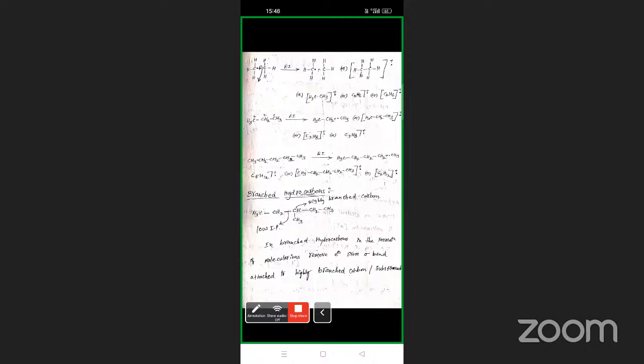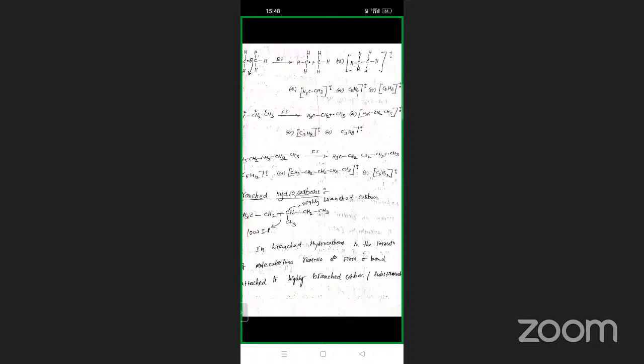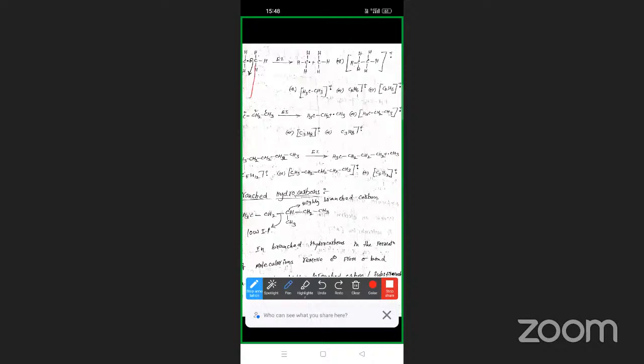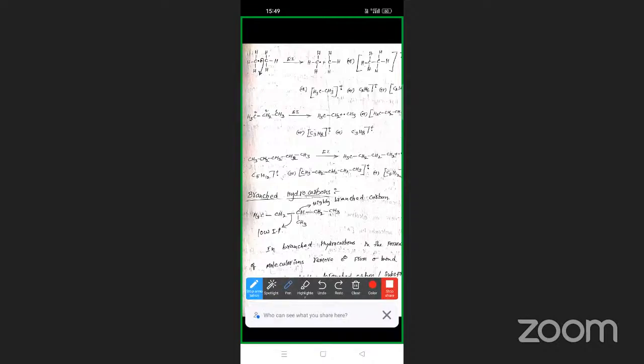Yes. So here you can see that upon removal of the CC bond electron, this electron is removed, and then we get this cation here. So you can write this molecular ion as a positive radical. Okay, so this is the way of writing the molecular ion. All these are ways of writing your molecular ion.